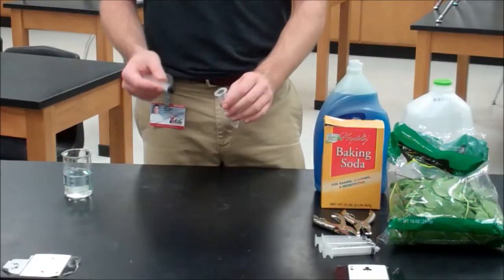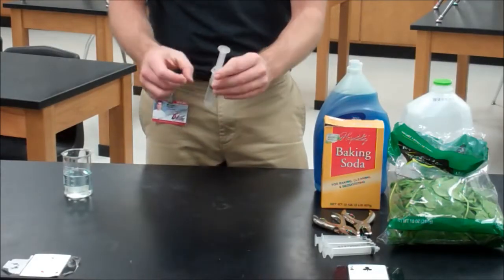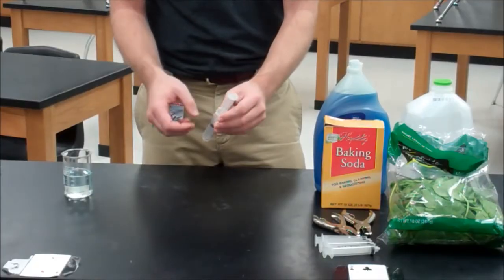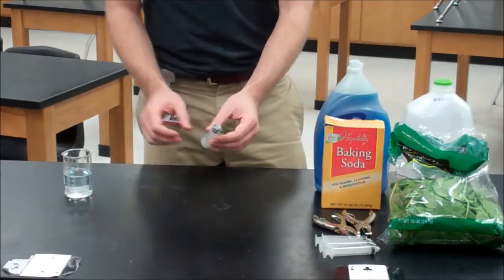Once we have as many as we need, we're going to close the syringe and push out as much of the air as we can get without crushing our leaf discs. Get the disc to lay flat, and then get as much of the air out as you can.